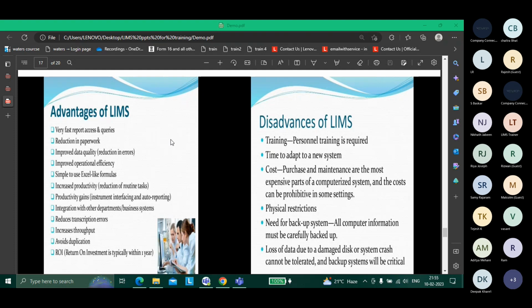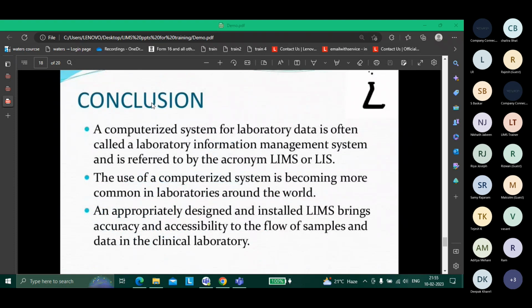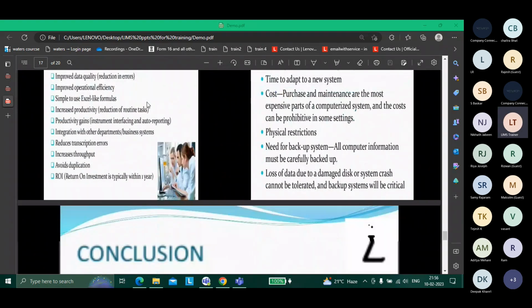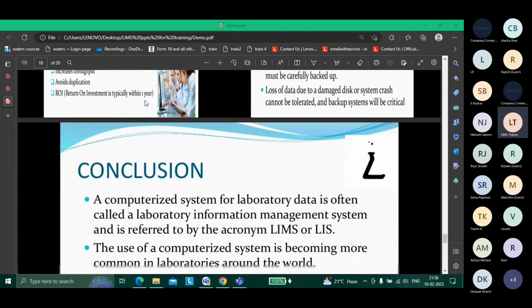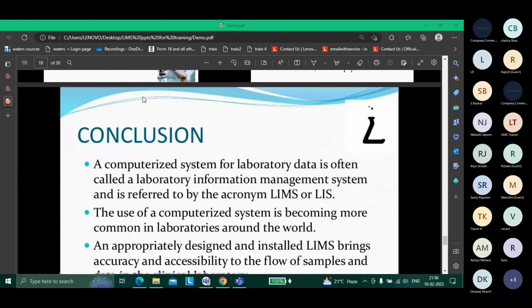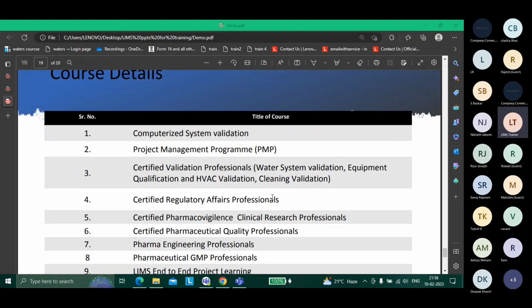Earlier it was stored in papers, which used to take very large spaces. Now it's stored in servers, but it takes comparatively less space. But again, it needs maintenance. Nothing in this material world is out of maintenance. Everything needs maintenance. Everything needs brushing up.